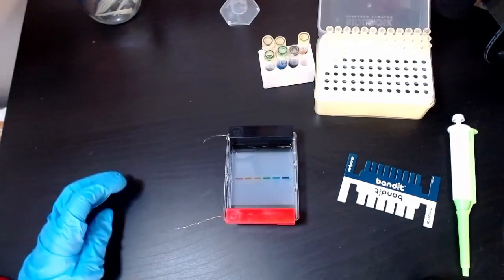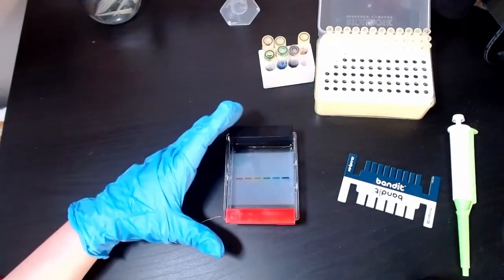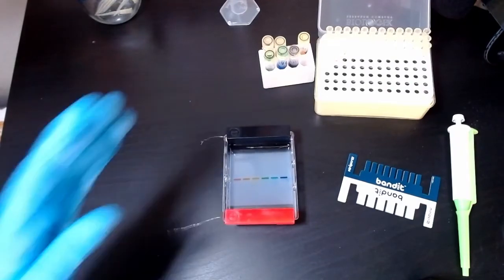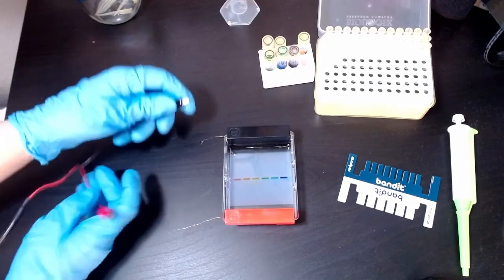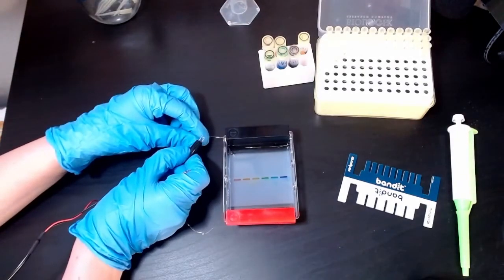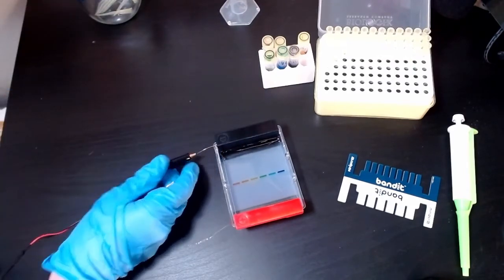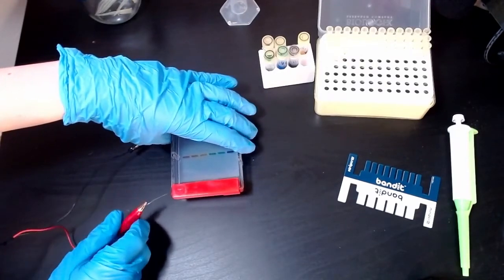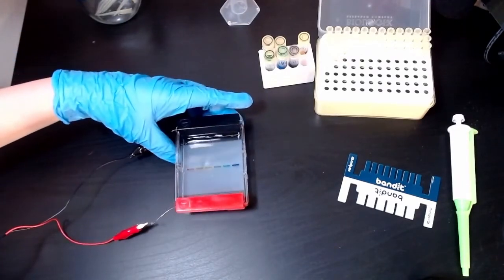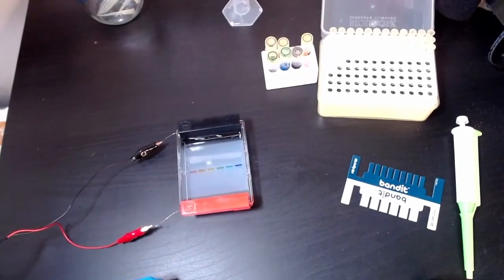Okay, so now you can see that we have our rainbow right here in our little Bandit gel electrophoresis box. And what I am going to do is connect our electrodes to our two leads here. Make sure I don't pull this off the desk. So we have connected our electrodes and we'll be able to see that it's working because we have little bubbles that are starting to form here.